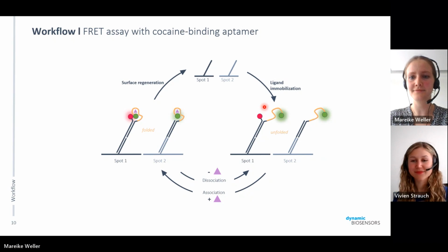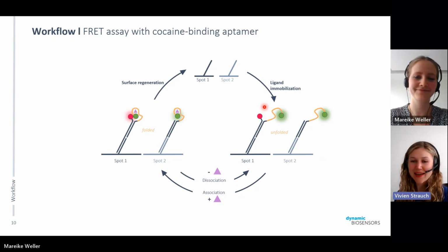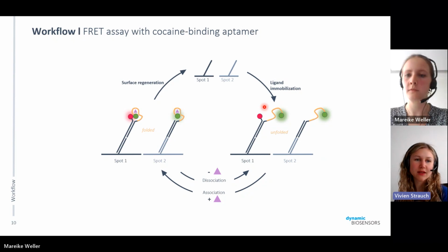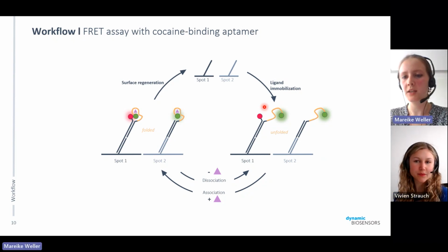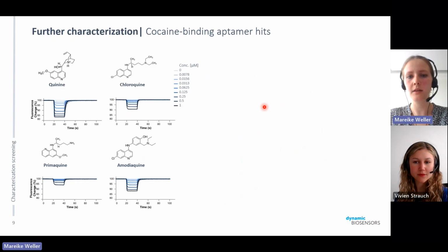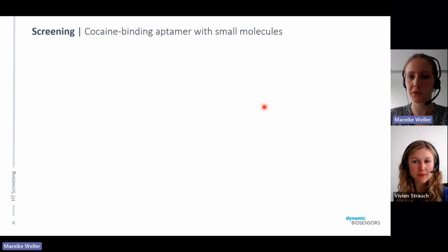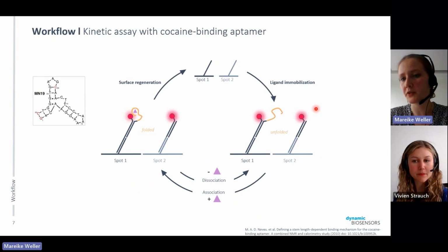Okay, cool. Now that we already talked about fluorescence, do you have any experience in the screening for autofluorescent compounds? Did you have any trouble with that? I haven't had any trouble with that here, but this is also maybe interesting to the question from before with the referencing of SPOT2.